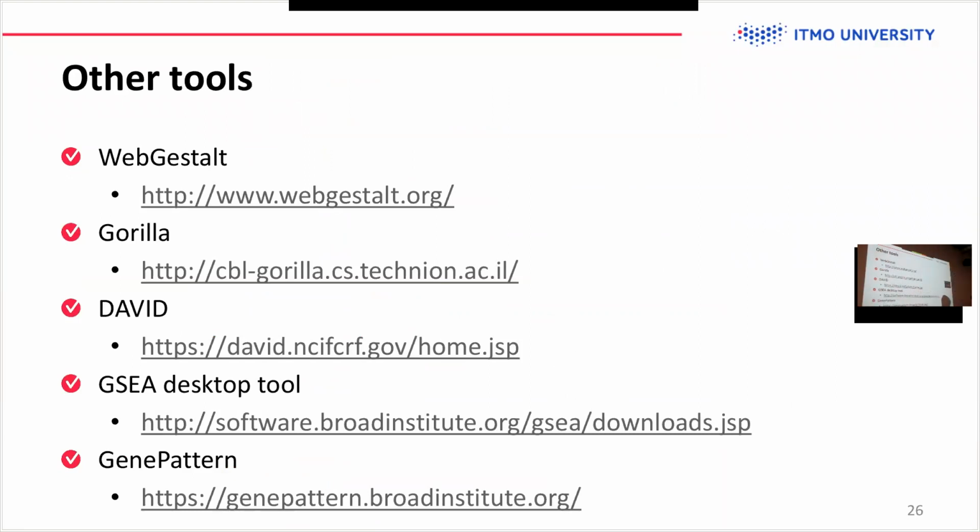Also, for this pathway analysis, there are a number of other tools that you can try to use. Historically I used the MSigDB tool a lot, and Enrichr when I wanted to look for some transcription regulation. But the WebGestalt site is very straightforward and simple.